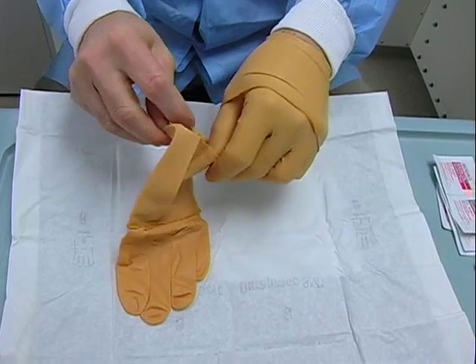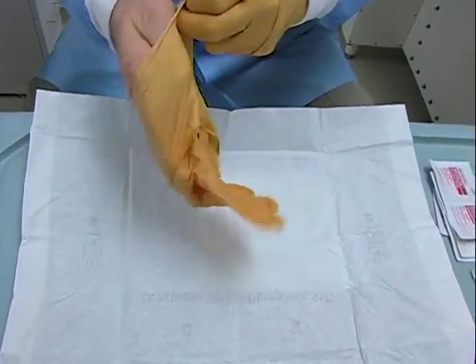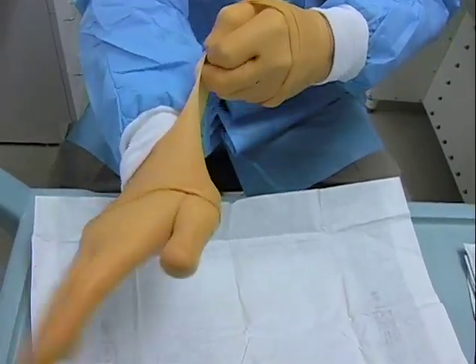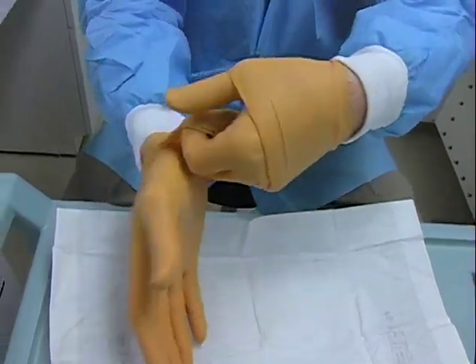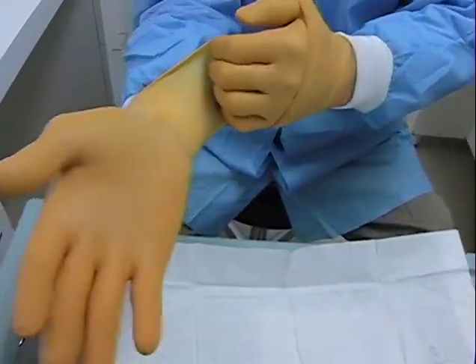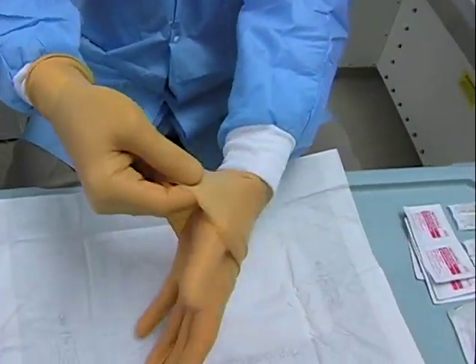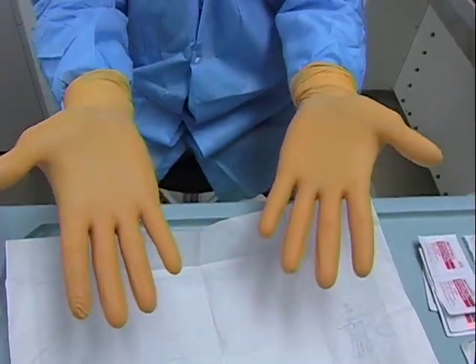Insert the fingertips into the correct glove, while carefully grasping its folded inner surface with the other hand, and pull the glove on completely. Don the second glove in the same way, taking care not to contaminate the fingers or palm of the opposite hand. Aseptically place the glove cuffs over the gown cuffs, assuring only sterile surfaces touch the sterile outer sides of the gloves.